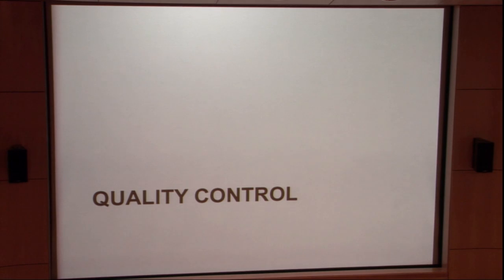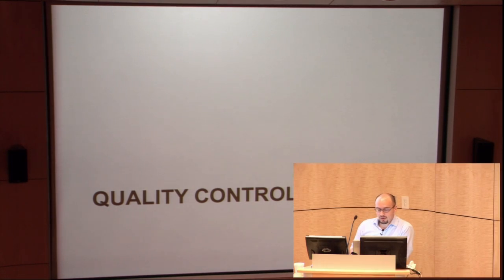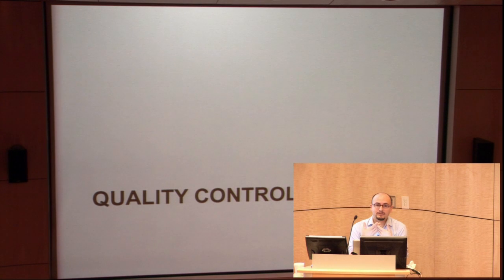So that's all great. I thought I would move on to, in the small amount of time we have left, talking a little bit about how to think about quality control. I mean, I'm talking about false positives a little bit. I'm talking about SNP calling. There are many approaches, many SNP callers. There's a temptation in this field to just develop whatever statistical algorithm you want to find variation, but not really follow up with differentiating the errors that it finds from the real things that it finds.